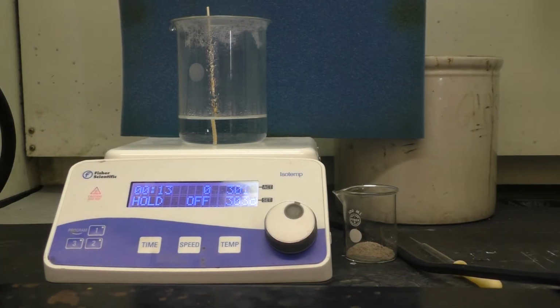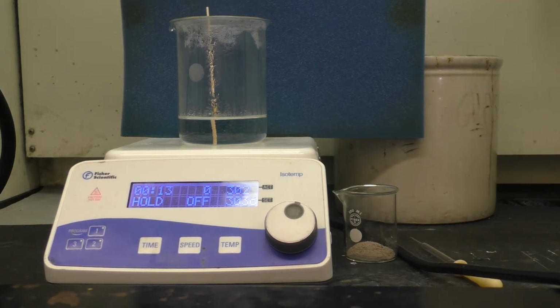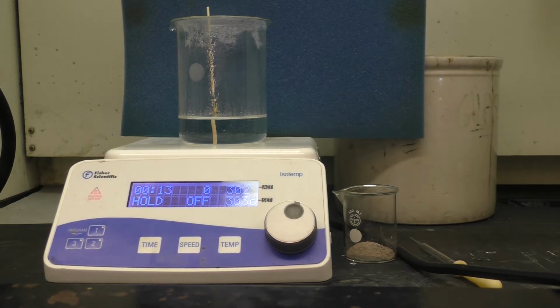So here we're all set to recrystallize the material, our crude acetaminophen. We've got some near boiling water. What we're going to try to do is use a minimal amount of that boiling or nearly boiling water to dissolve the crude acetaminophen, and we'll do this on the hot plate.